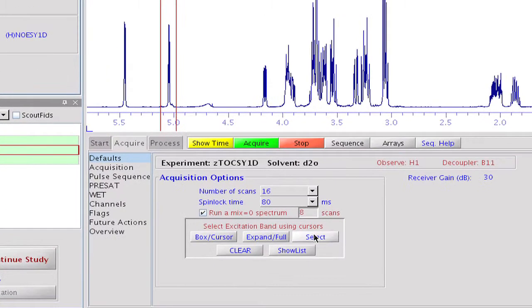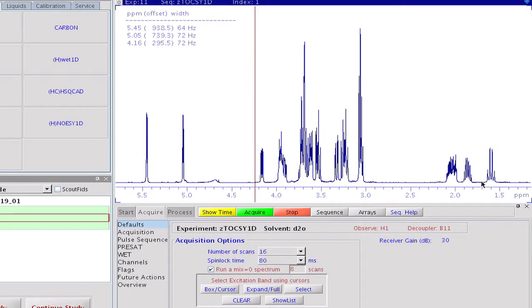We may then select the other anomeric proton, then the multiplet at 4.2 ppm, and the last quartet signal at 1.6 ppm. If we had more targets we could continue until all requested signals are selected.